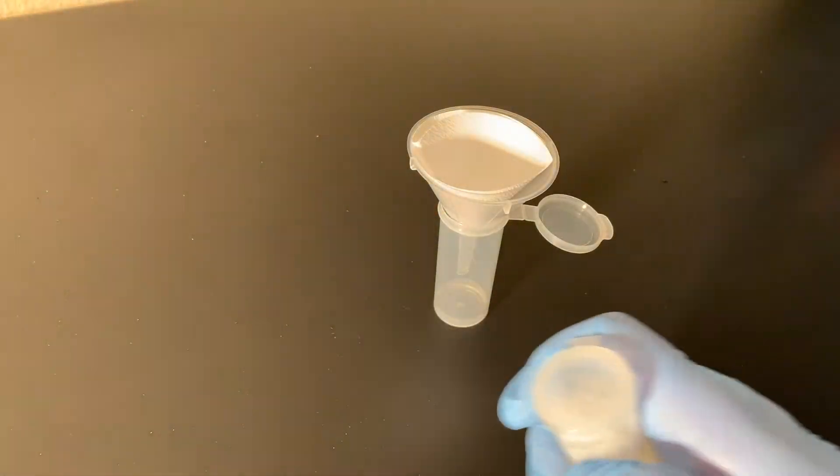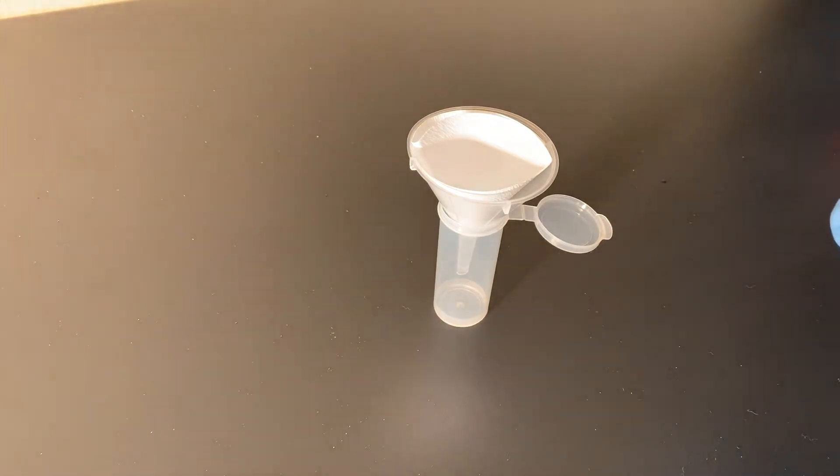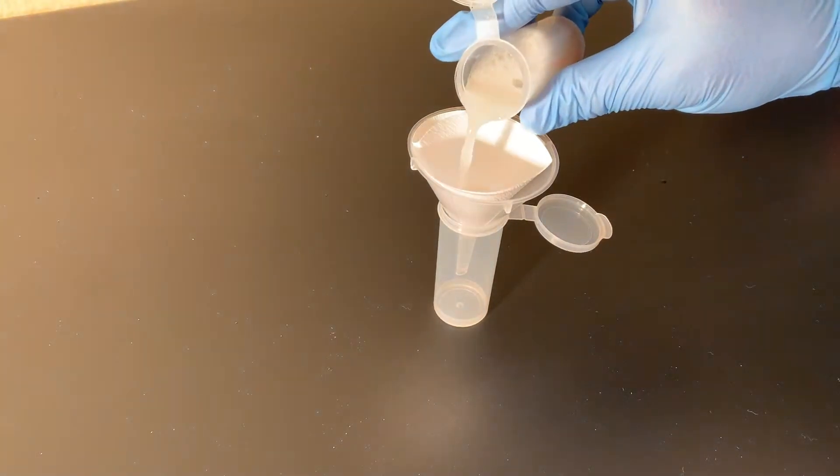Filter the extract into a clean tube. You can filter the extract up to 5 minutes.